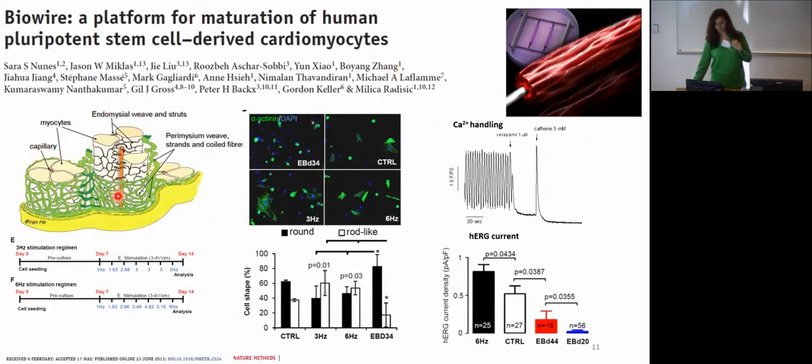To enable that following to occur, we would place one suture in a microfabricated well, and then take cardiomyocytes derived from iPS cells or human embryonic stem cells, according to protocols that Gordon Keller published, and using hydrogels, we would seed them into one of these wells. The cells start pulling on the matrix and remodel the gel, and then they hit the suture, they have nowhere to go, so they have to start elongating. That was one step: controlling the microenvironment structure and a little bit of mechanical properties by the tension that we control through cell remodeling of the matrix.